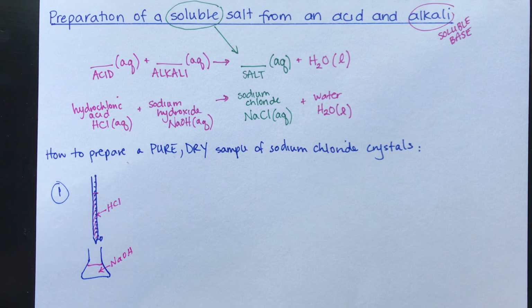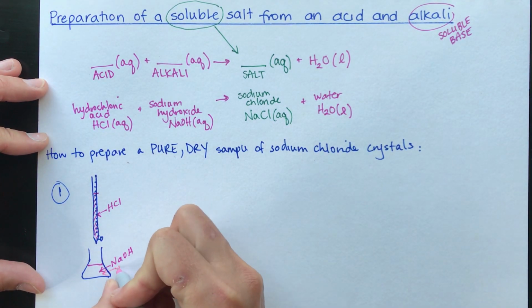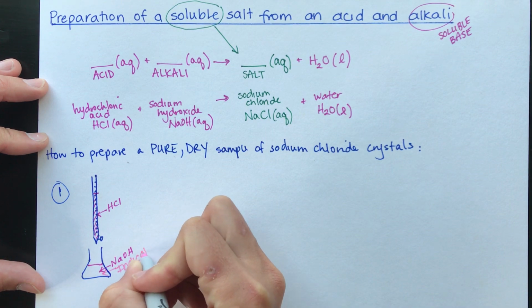How will I know when it's complete? NaOH is colorless, HCl is colorless. Well, I need to add something that can change color when all the NaOH has been neutralized. And hopefully in your heads you're all saying, oh, an indicator. The answer is yes, we add an indicator.